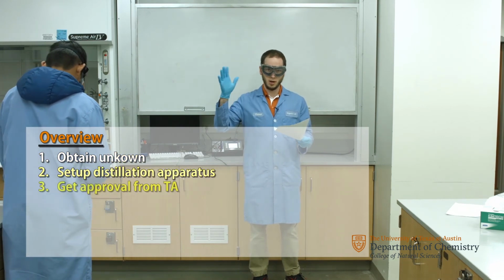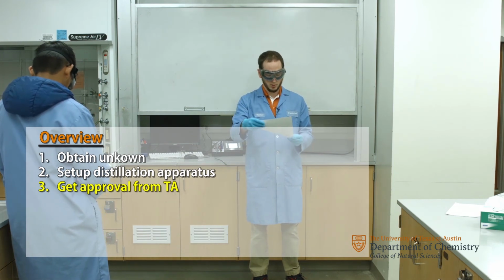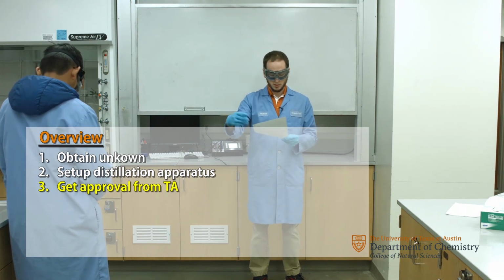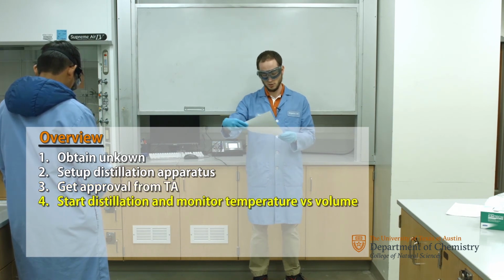Once that's all set up, you're going to go ahead and flag me down. I'll come over and make sure everything is set up appropriately. Once I've given you the okay, you can go ahead and take your round bottom flask, go over to get the unknown sample from the sample hood. Take it back to your hood and start the distillation, monitoring the temperatures and the volumes that you're collecting.